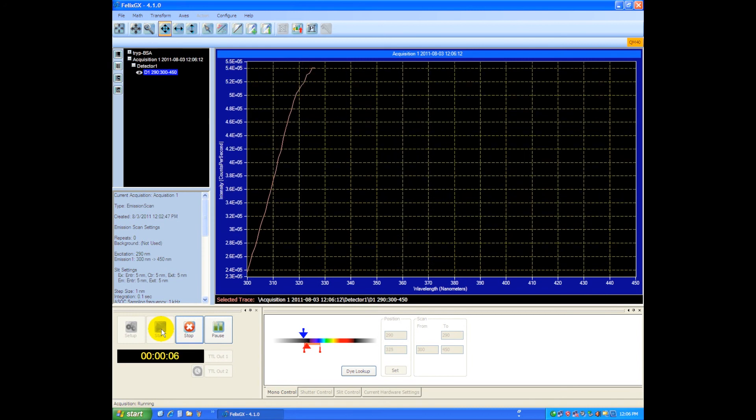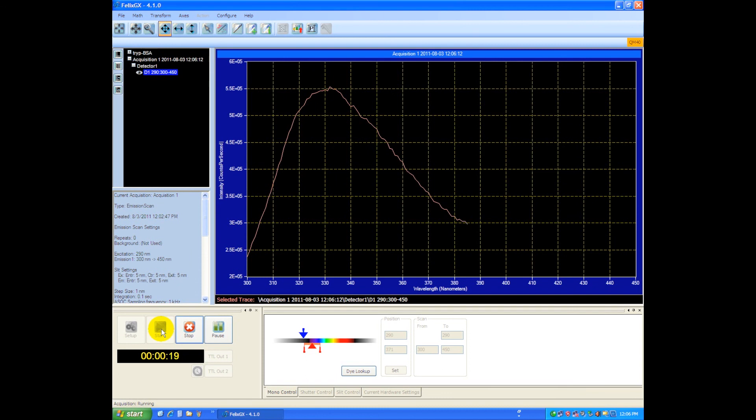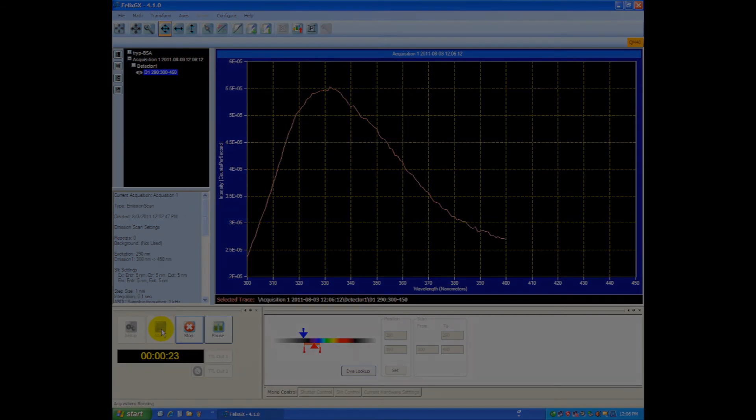So you can see the data trace is a little smoother looking because we have a longer integration time. Depending on your sample, you'll have to adjust the integration time accordingly. Of course, you can also adjust the light input if you need more or less light with the monochromator slits, but that's the basic premise behind doing an emission scan.